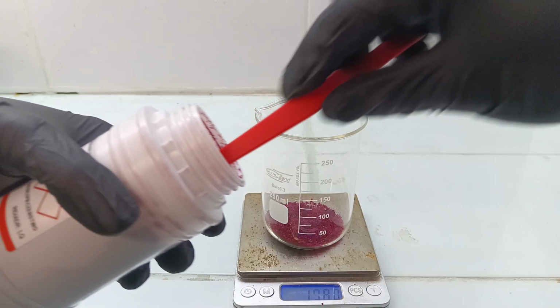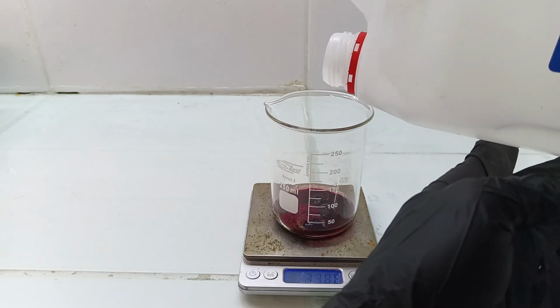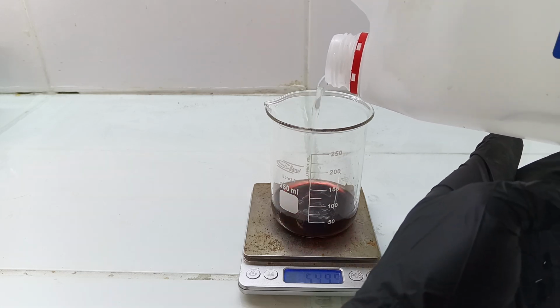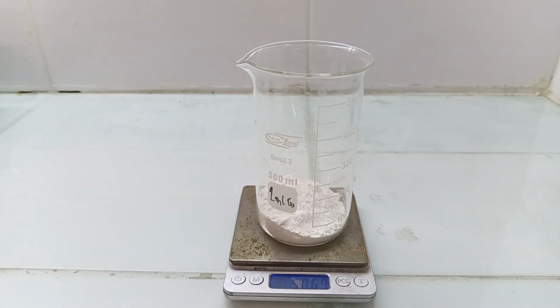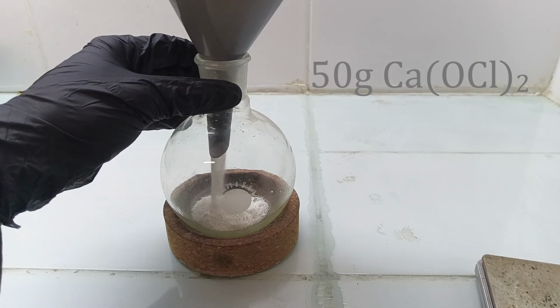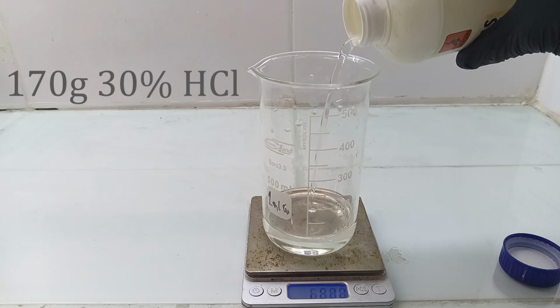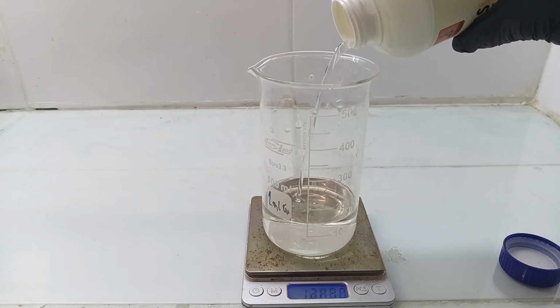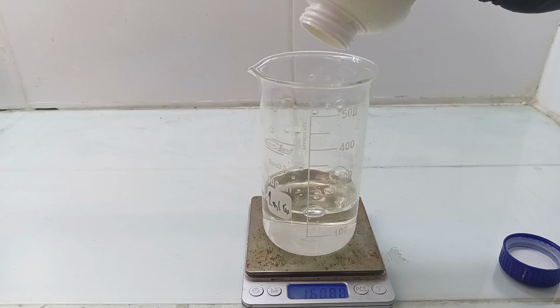I first measured out 20 grams of cobalt 2 chloride hexahydrate and dissolved it in 40 grams of water. The paper I'm following mentions that the amount of solvent needs to be somewhat precise. While that was dissolving, I prepared the chlorine generator. I measured out 50 grams of calcium hypochlorite and put it in a round bottom flask. After washing out the beaker, I measured out 170 grams of 30% hydrochloric acid. The exact amount of both of these doesn't really matter since I am using a large excess of chlorine gas.